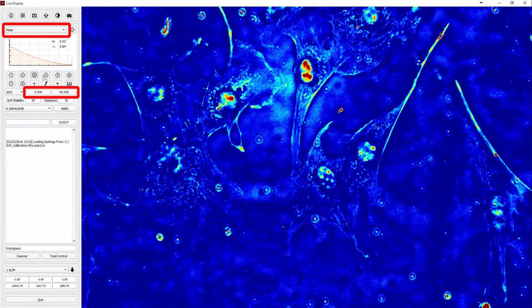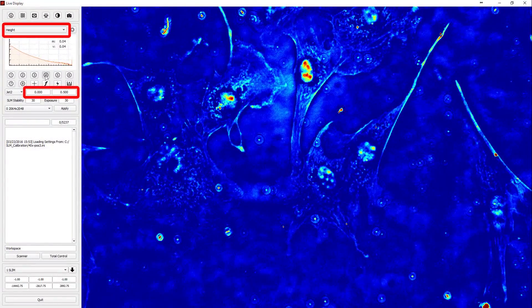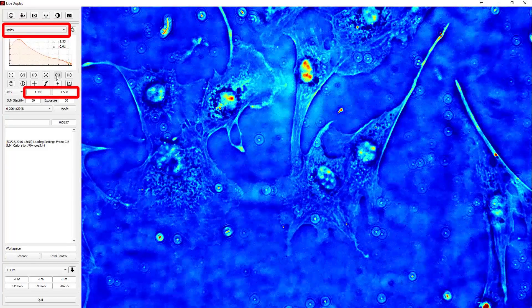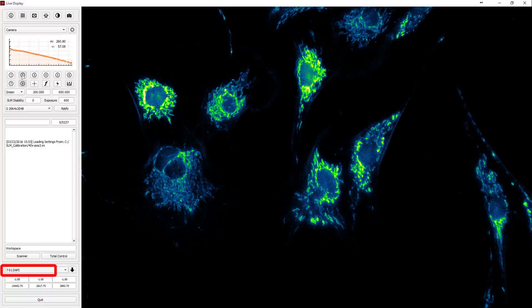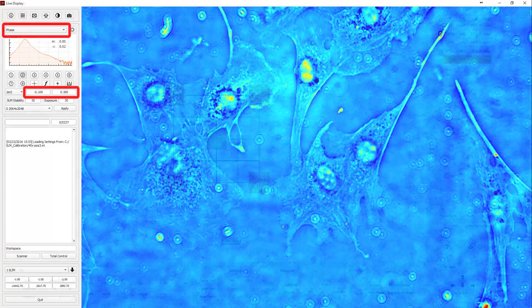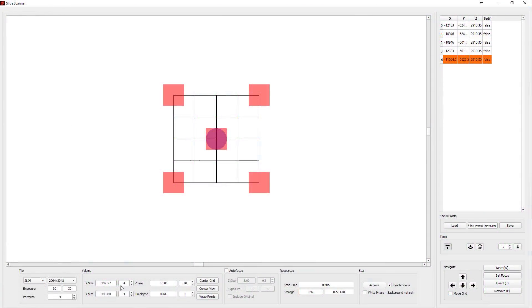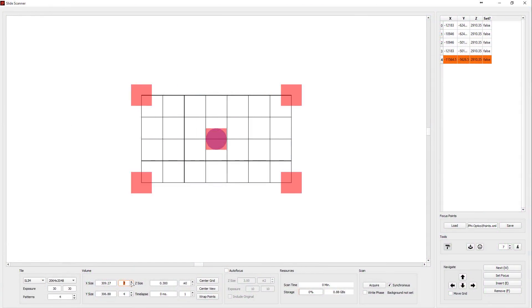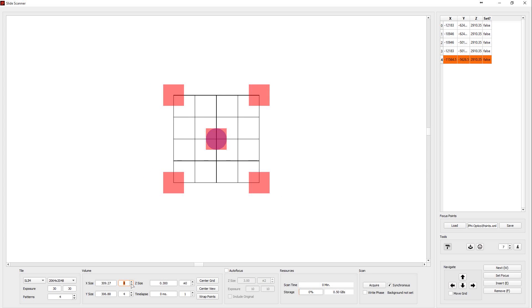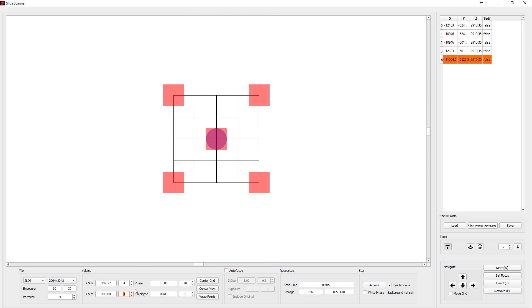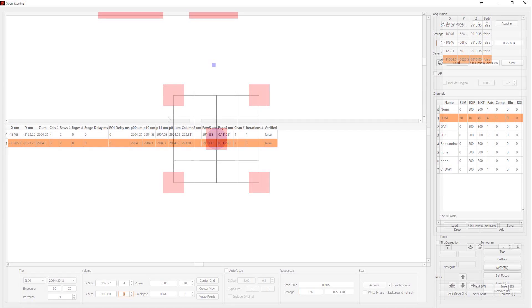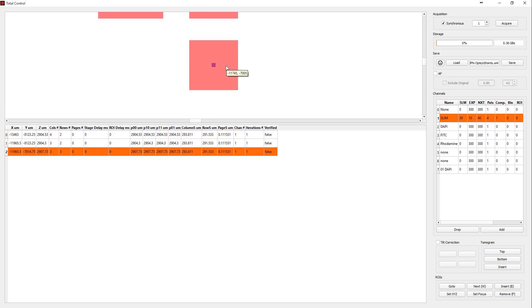The software running on the SLIM PRO model is extremely powerful and performs many tasks in parallel. At the same time, you will love how easy it is to use. If you want to image a large mosaic, all you need to do is select your objective, set the limits of the scan, and click start. You can even do multiple mosaics when imaging a multi-well plate.